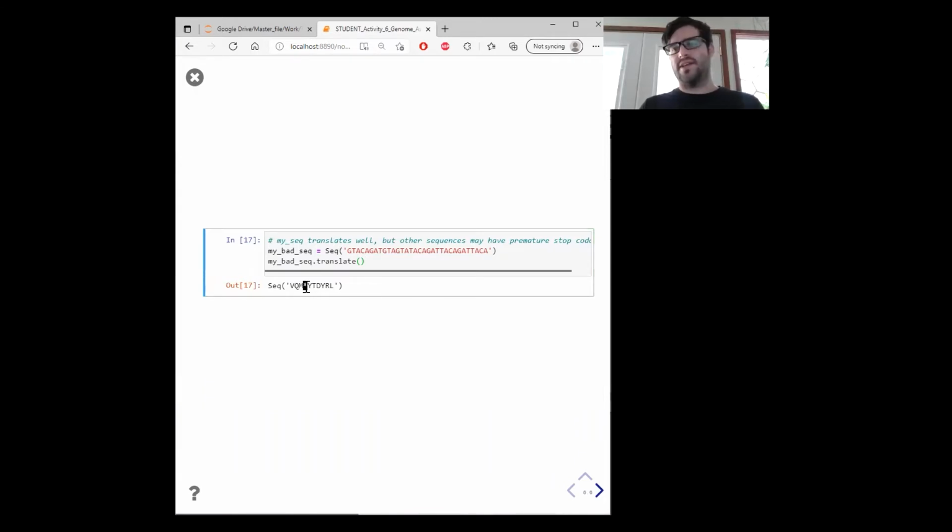And what this specifies is a premature stop codon. And so as we were translating each of these 3 codons, it encountered a TAG, I believe, which is the typical stop codon. And so if this were a ribosome, as the RNA molecule were moving through the ribosome, if it encountered a stop codon, it would just release the peptide, release the piece of RNA, and stop.